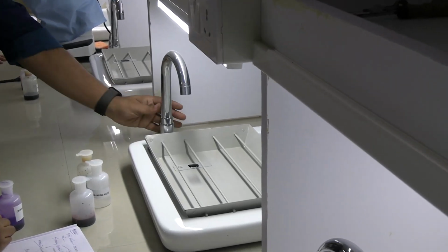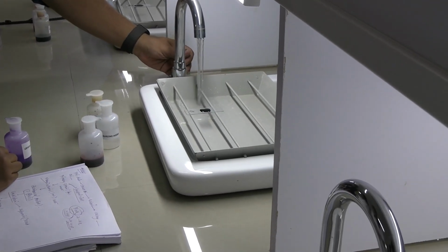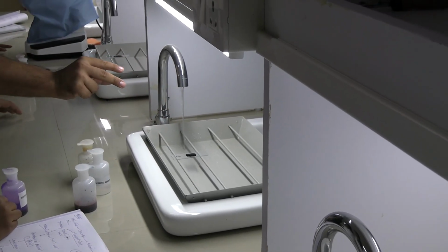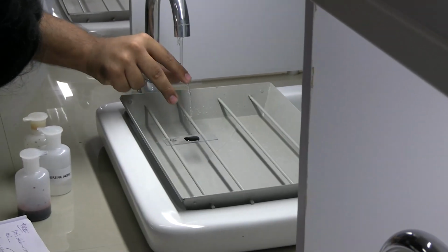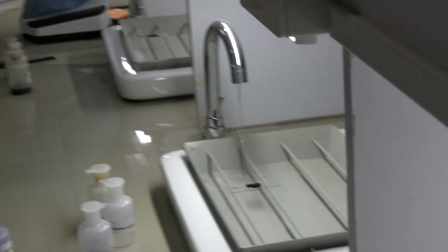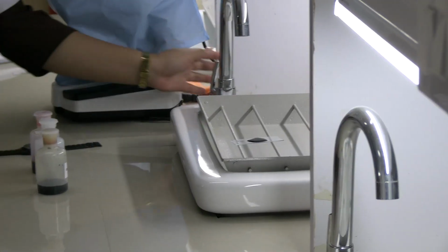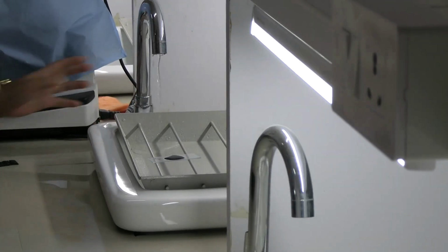Okay, so remember, you should also check whether the tap works or not. The tap works, but it has some problems with the flow. So we'll hold the slide like this, and we will look at my hands. You will hold the slide like this with the thumb and the middle finger, and you are gonna use the index finger to direct the flow of water, okay? Don't move it too much. Just open it a little bit to see if your tap works or not. It works now, okay. Close it down.